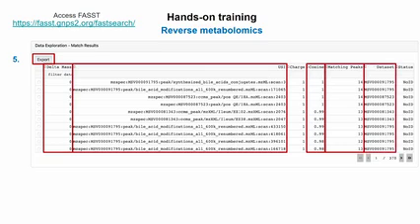And you also get the information about the data sets where this MS/MS spectrum is, and that would be crucial for you to know in the upcoming step, to match with the body part and other things. So basically what you need to do now is click export, and then it should be downloaded automatically, depending upon where your download folder is. The export should be a CSV file, right?